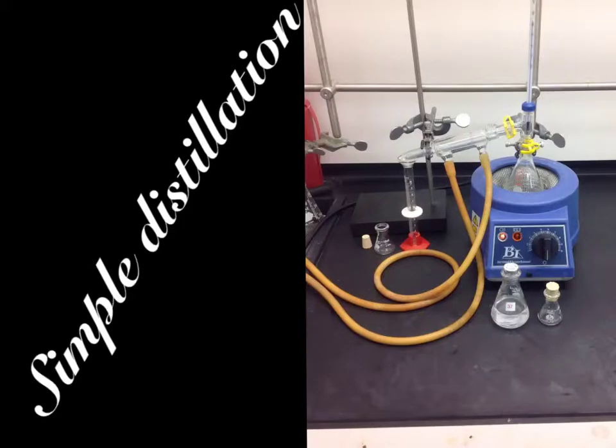This was the distillation apparatus used for the experiment. The ethanol water solution was put into the distillation flask here. As the solution heated, the ethanol vaporized much sooner than the water because it is a more volatile substance. The ethanol vapor then entered the condenser, where it was cooled back into the liquid phase and later collected. One complete cycle of evaporation and condensation is the function of simple distillation.